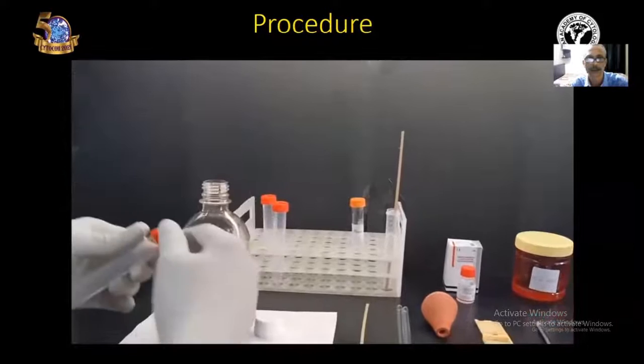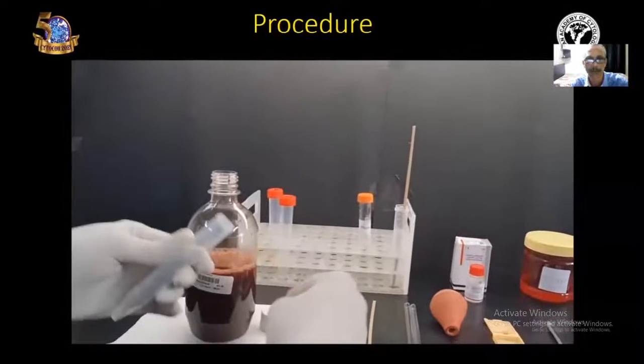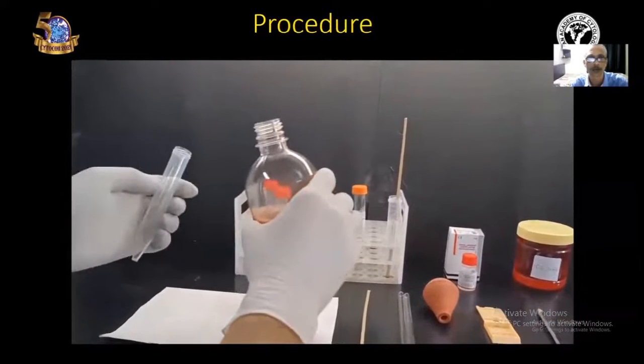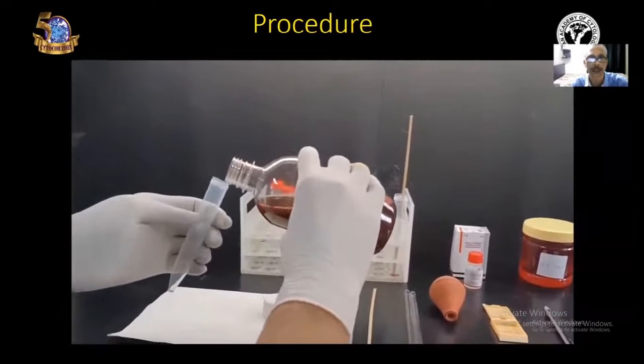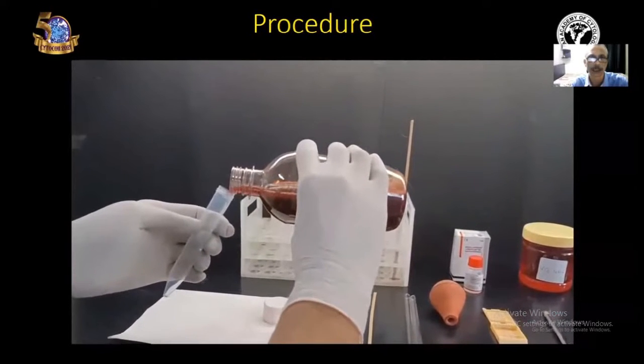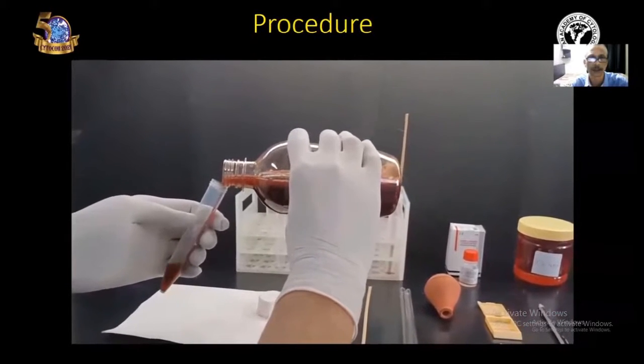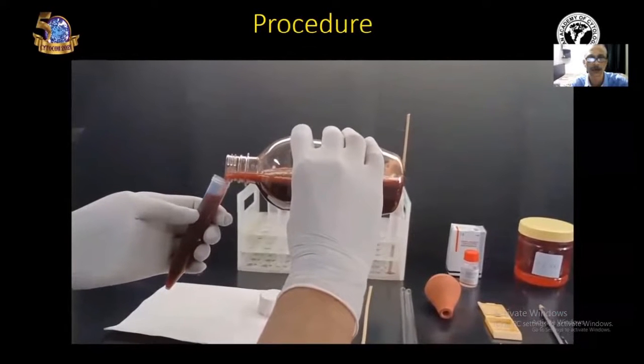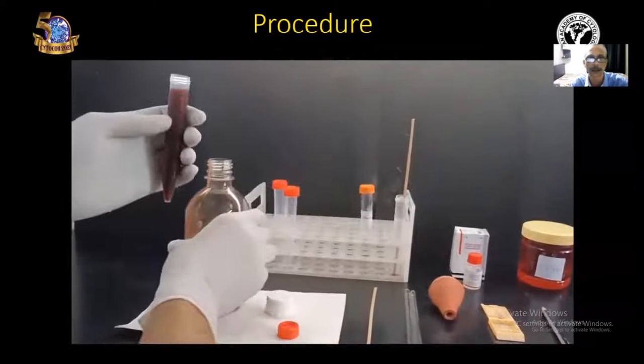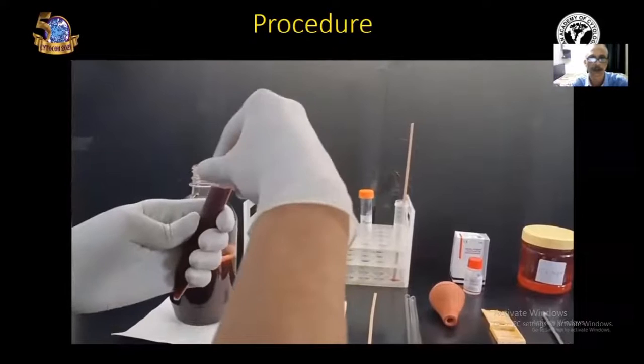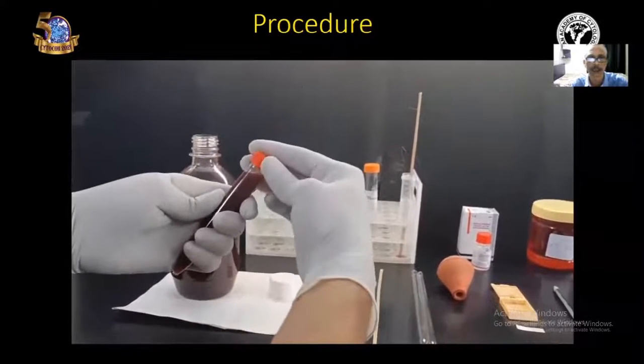Take out the centrifuge tube, remove the cap, and slowly put the sample into the centrifuge tube. Care has to be taken not to spill the sample. Once the sample is put, put the lid and secure the lid properly.